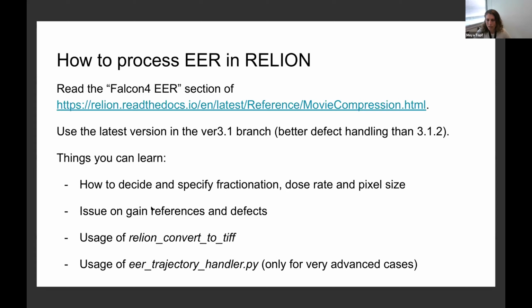Okay, thank you. And final question. This is from Marcus Gallagher-Jones. I was curious to hear your thoughts on refining charge states within cryo-EM maps. Given the profiles of charge form factors for electrons, do you think the low resolution frequencies are sampled well enough in cryo-EM?